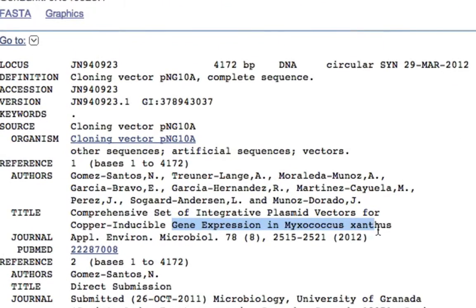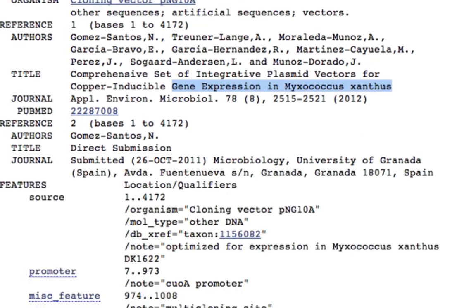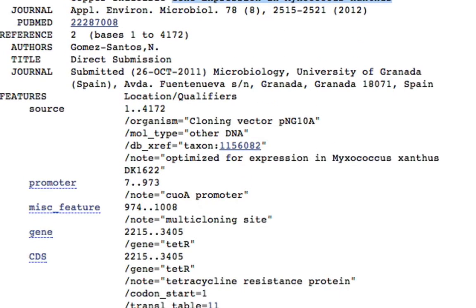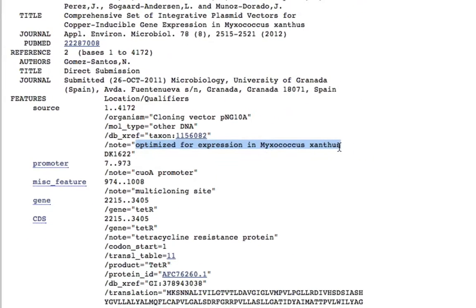This is for gene expression, copper inducible gene expression in Myxococcus xanthus. Here you go, so this is what you are looking for.